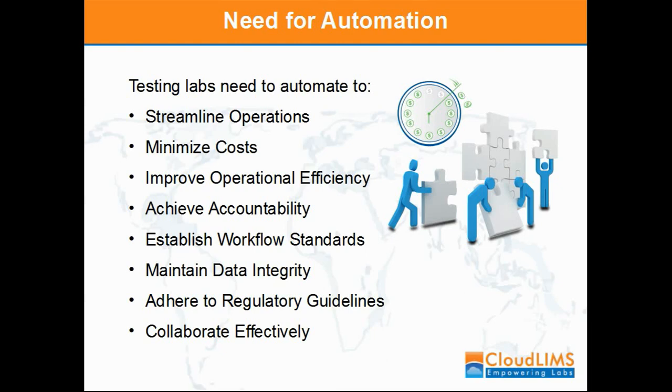It also helps in presenting the lab in a more professional manner to various collaborators and granting authorities by enabling end-to-end sample and workflow management. It assures traceability of results and maintains data integrity by following standard lab practices. The results are achieved faster, are far more accurate, reproducible, and reliable. The data is easier to store, trace, and access over time and across experiments so that lab processes can be monitored and improved to increase operational efficiency.